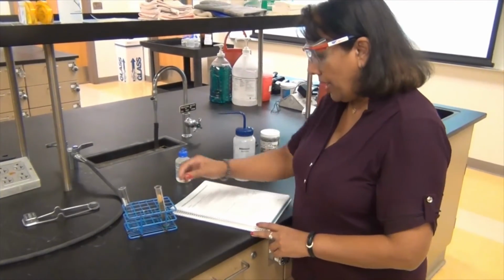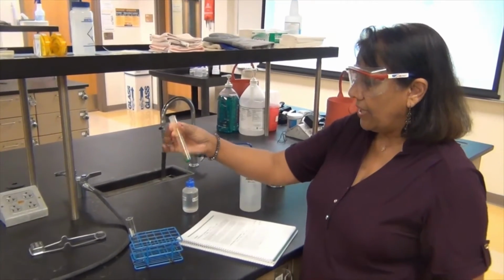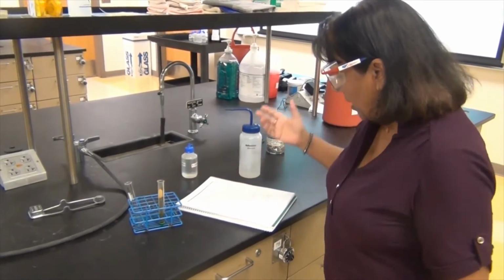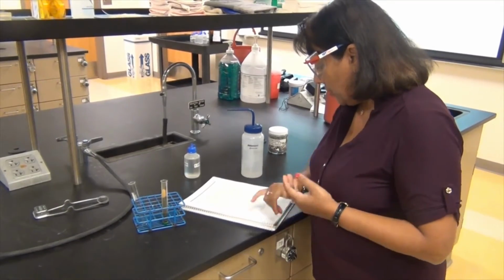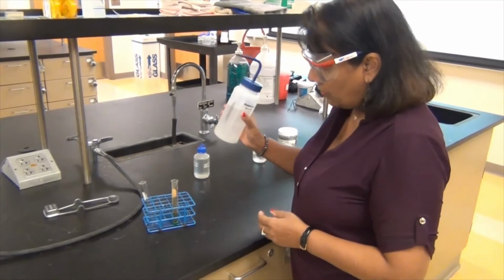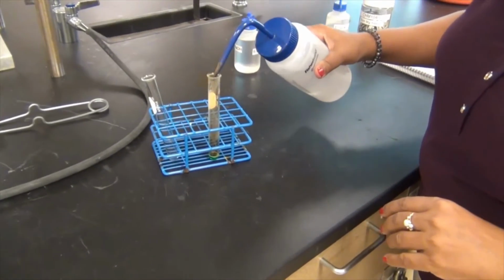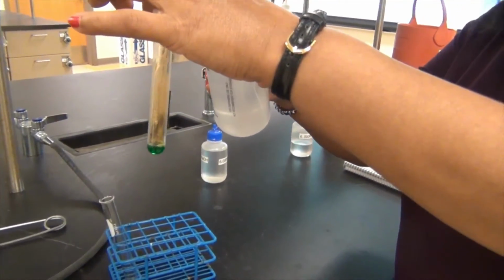Okay, so I added the nitric acid that was in the hood. Now I'm out here. So it says that I should wait a little bit, but the waiting is only for the copper to react. So it's all reacted right now. So I'm here right now in step number 3, and step number 3 tells me to add 10 drops of water. So I'm going to squirt just a little bit of distilled water in there. And trust me, I will not ruin your experiment. Okay, so you'll be fine with that. And so here, let me lift this up so you can see what's going on.